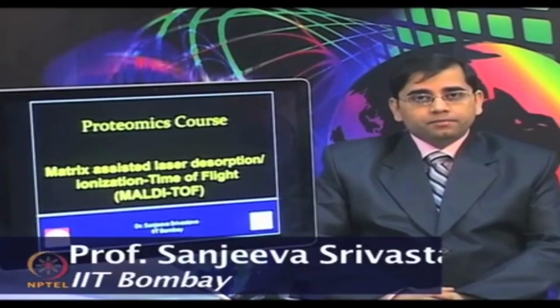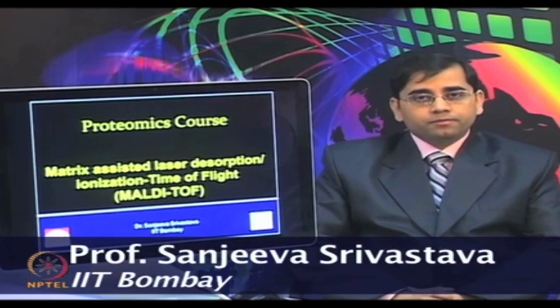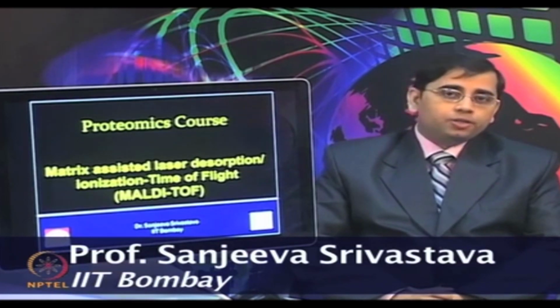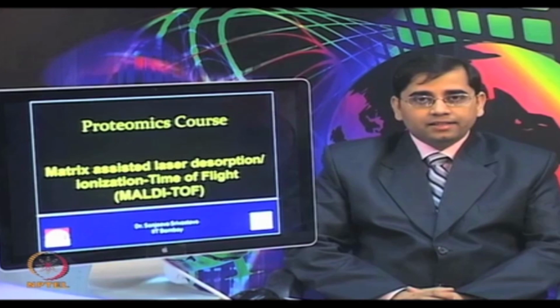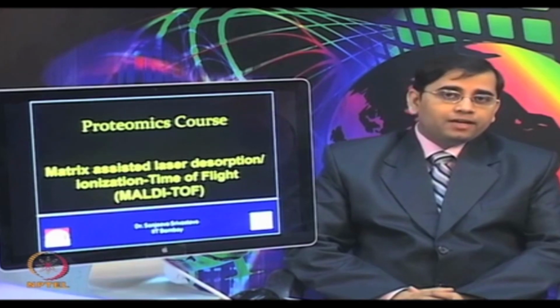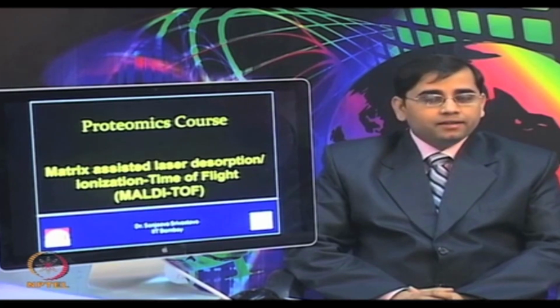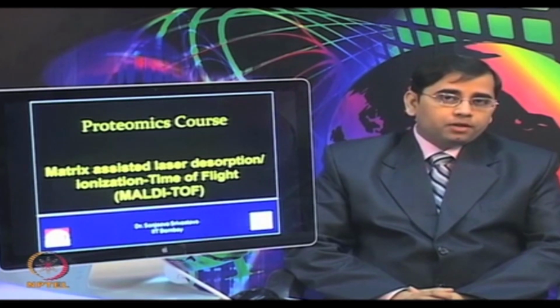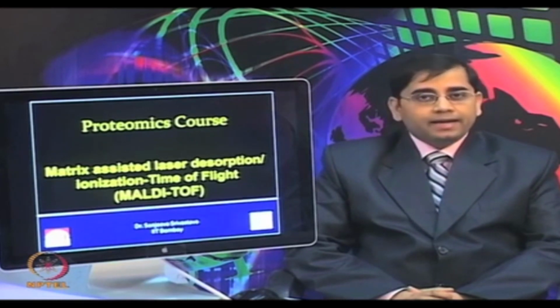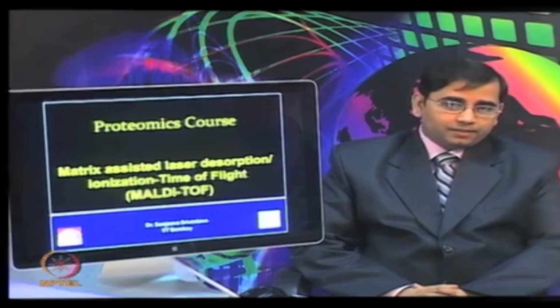In the previous lecture, we talked about the basics of mass spectrometry, the various combinations of mass analyzers and ionization sources. Now, it is time for us to combine those and start discussing these in more detail. So, today let us focus on MALDI TOF, which is one of the very widely used techniques in proteomics. This provides a high throughput platform for several applications, including molecular weight determination, protein identification, as well as post translational modification studies.